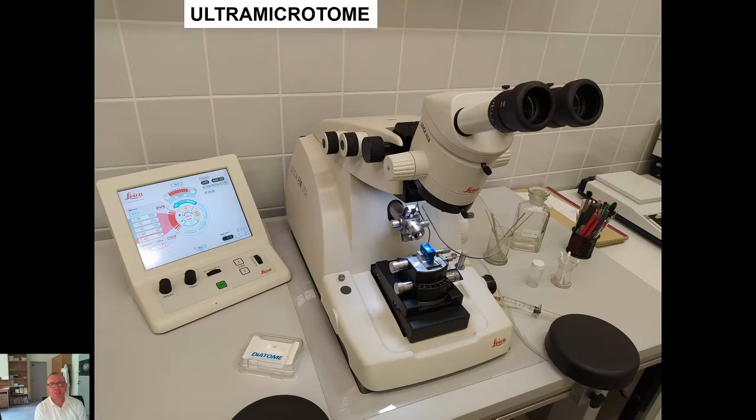Ultramicrotome is using sharper knives, and other holders of specimen, because the specimen is very small, and as everything there is small, not only the specimen but also the sections, the ultramicrotome is equipped with a binocular eyepiece to magnify the scene here in the area where the sectioning is.